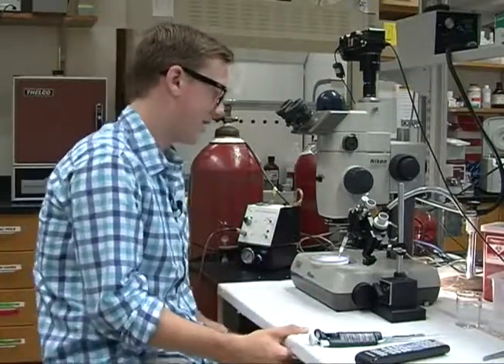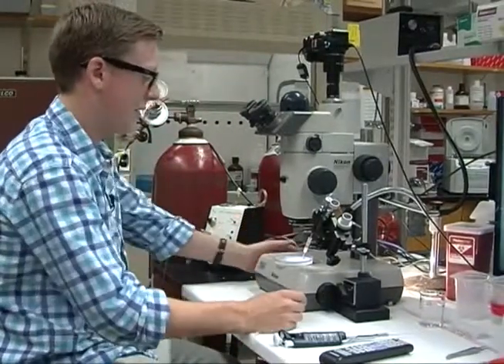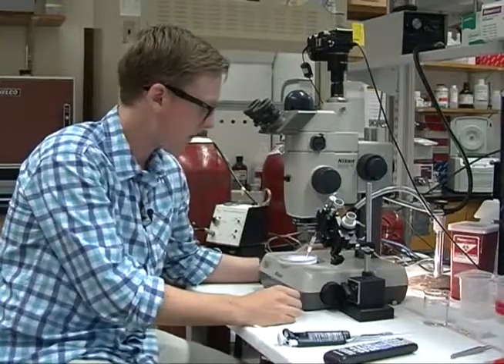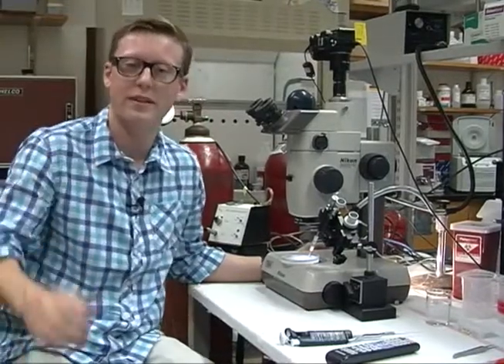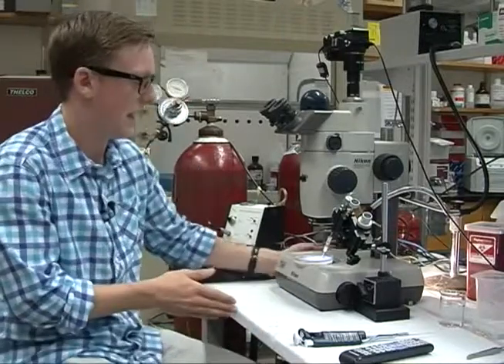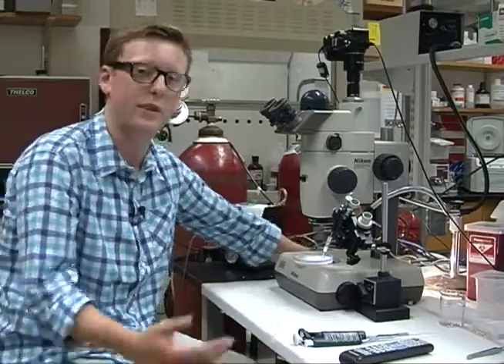So the process, like I said, is to pull the needle, and we then harvest the embryos from the fish room, and we hustle them back to the lab because you have to inject them around the 2 to 4 cell stage, because once they get too old, it won't get into all the cells. So that's about the stage that we're at now. We line them up in a plate mold that we made a few days before, and we do the injections.